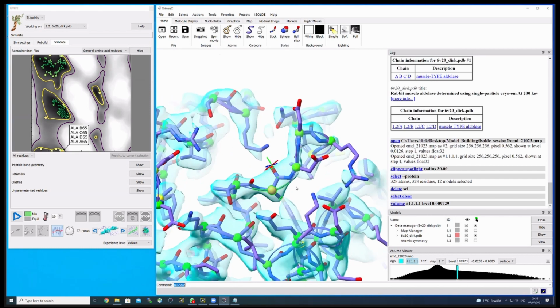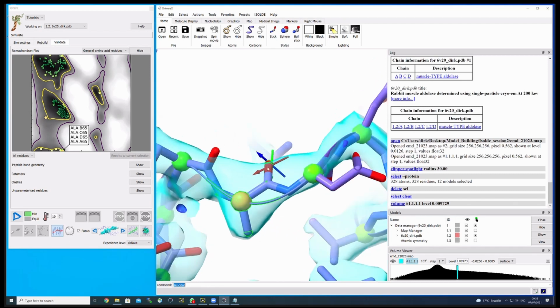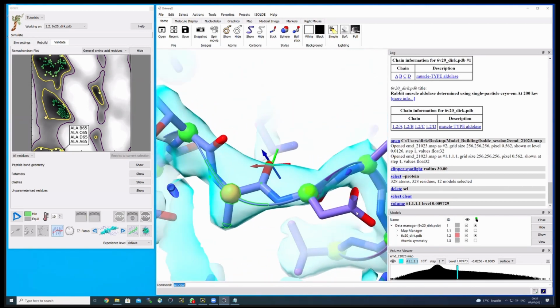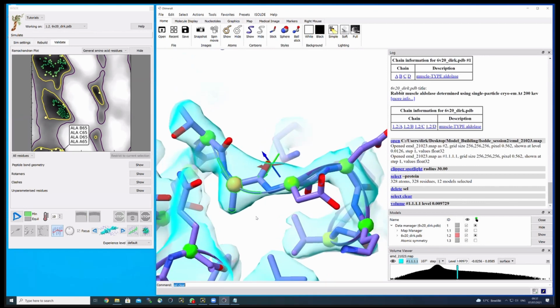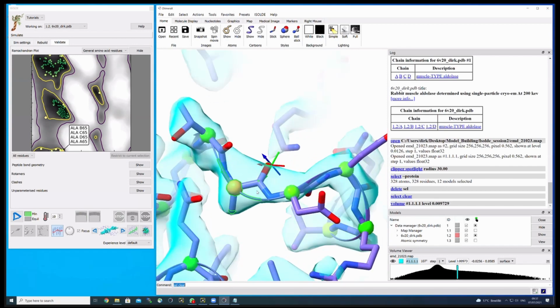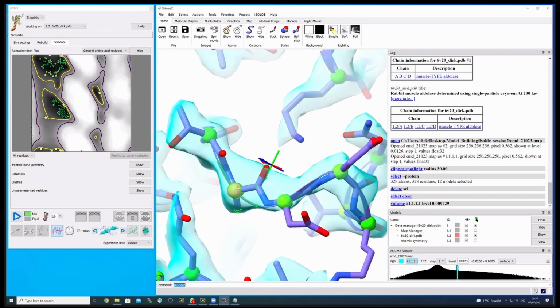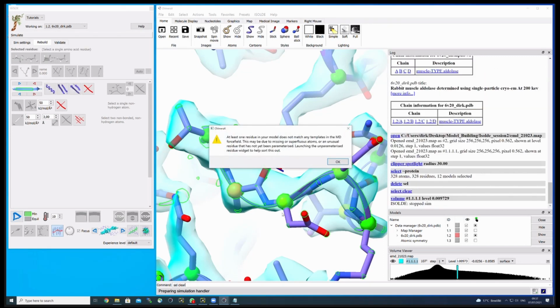And the reason why this is an outlier is maybe because what you can see here already is that the two oxygen atoms of the peptide backbone are more or less pointing in similar directions. And this is typically not the case in protein structures. It's typically the opposite configuration which is preferred, with one exception, and that can be proline, and maybe very, very rare cases in which you have such a backbone configuration. And this is why in the rebuild tab you have this configuration that you can change from cis to trans. So I will try to fix this.